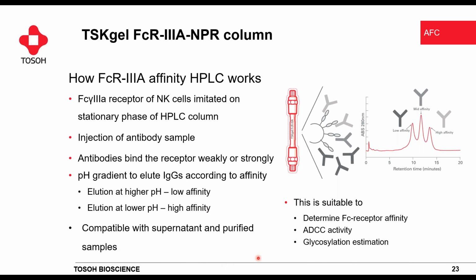So it's suitable to determine Fc receptor affinity. Also, and this is often interesting for biotherapeutics, the ADCC activity and the glycosylation estimation can be done with this. And you can also use it with supernatant or purified samples. So you don't have to clean up your sample before, you can just run it and see what happens and get an idea of what's in your sample. It's a really nice method.